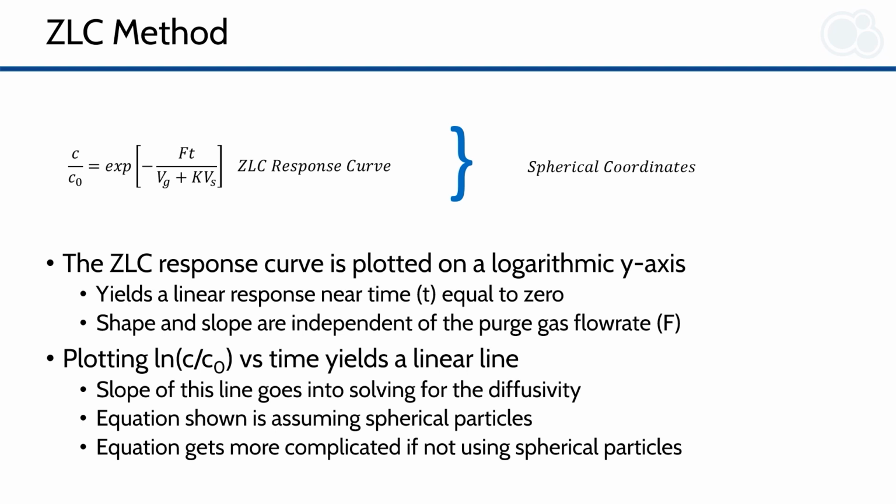The equation that's shown above, as I mentioned, is specifically for spherical particles, and as I said before, the mathematics get a lot more complicated if you don't have spherical particles, and that's not something that I'm going to cover. For this talk, I'm going to be focusing specifically on spherical particles because it greatly simplifies the math.